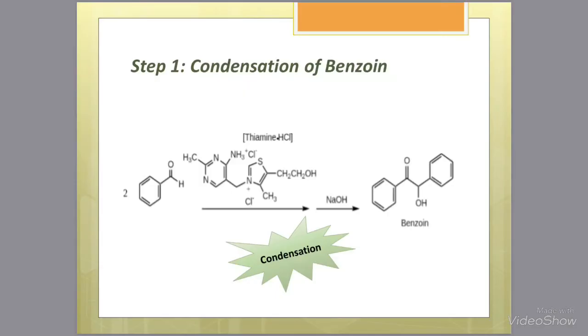This reaction does not occur spontaneously. It needs a catalyst. This catalyst is needed to render the aldehydic carbon acidic, so that it can be deprotonated and function as a nucleophile in order to attack the second benzaldehyde carbonyl. For more than 100 years, the only species that had been found to satisfy the requirements for an effective catalyst of the benzoin condensation was the cyanide ion.